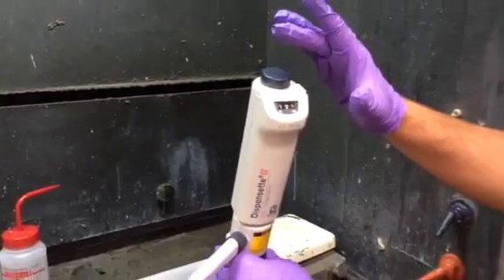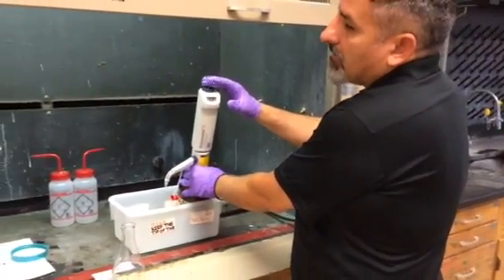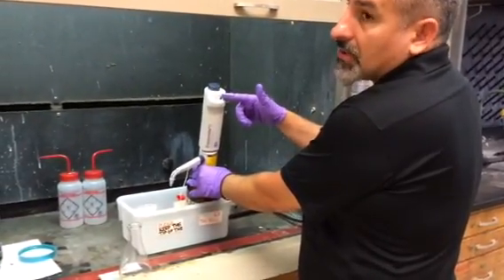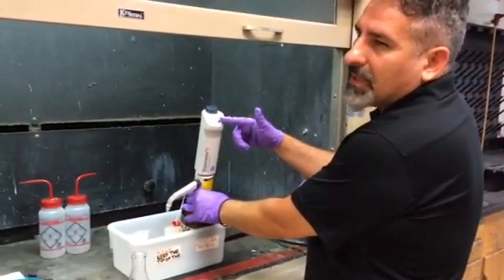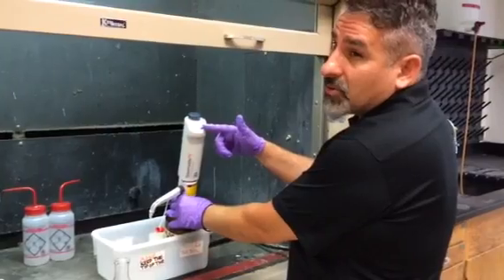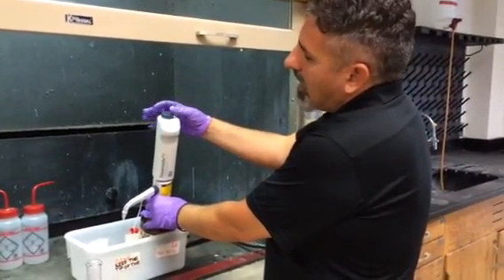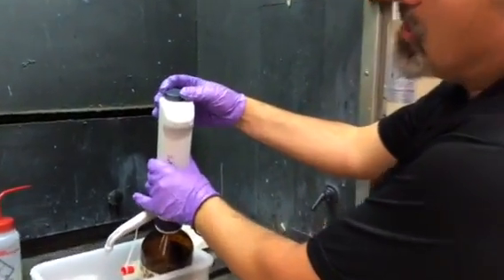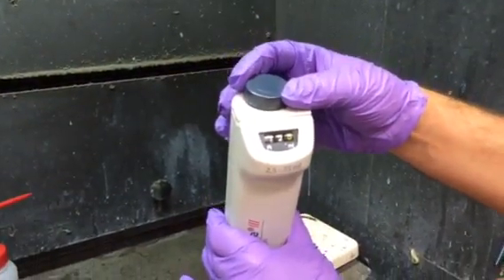Remind students that they cannot rotate the dispenser — they should leave it as it is. Before putting any sulfuric acid into the flask, they need to make sure the dispenser reads 12.5. If it doesn't, it's their responsibility to let you know so it can be adjusted. Students should not be adjusting this themselves. If you have to adjust it, you rotate this part here — you can see it goes 12.7, 12.8; it was at 12.5.